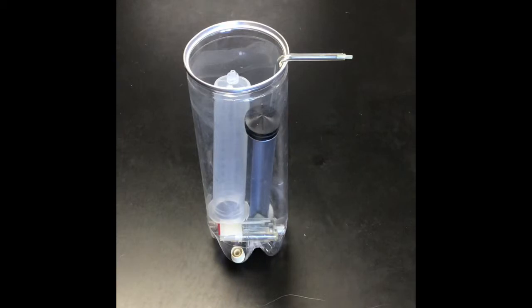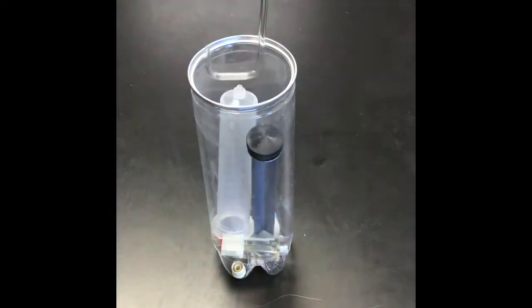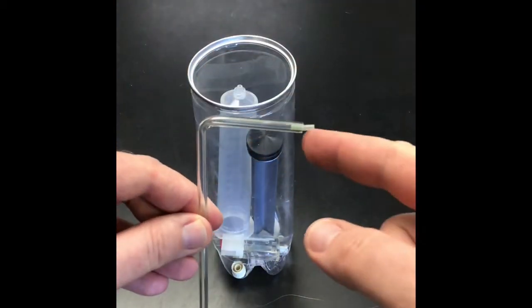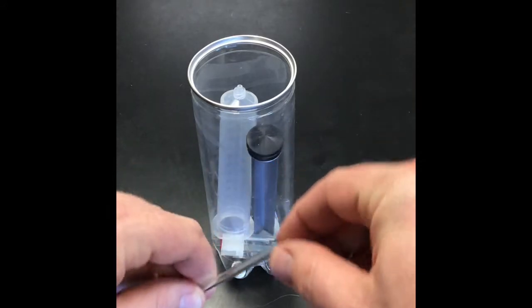So all of the equipment you're going to need for this lab to determine the molar mass of butane is in this container, except for the electronic balance. In this container, you've got the glass J tube, and in that J tube, you're probably going to see this little rubber adapter piece. This is what's going to hook to the butane source.